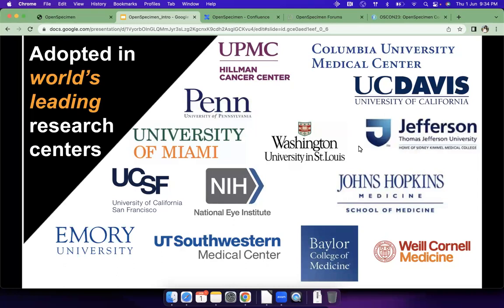For example, Washington University uses it for more than 30 plus labs, multiple hundreds of protocols, hundreds of users using it concurrently for millions of samples. So it is used both at large scale like this, as well as by individual PIs or smaller clinical studies. So there is no restriction on how big the installation is or how many users are going to use it. So there is no restriction in terms of licensing.